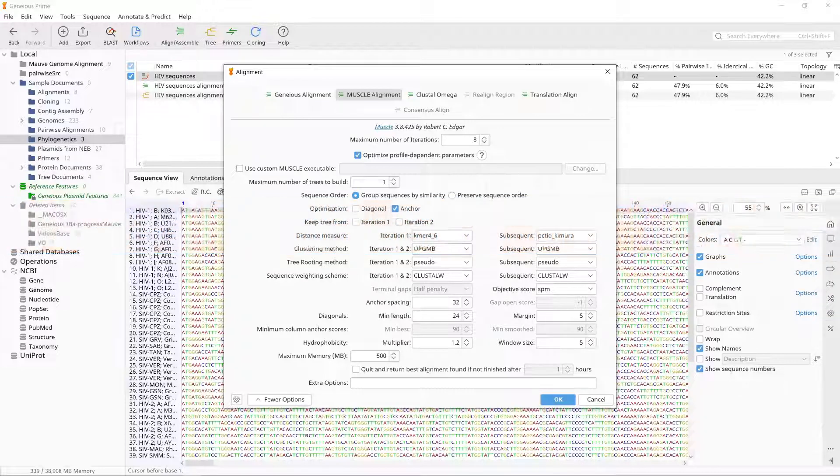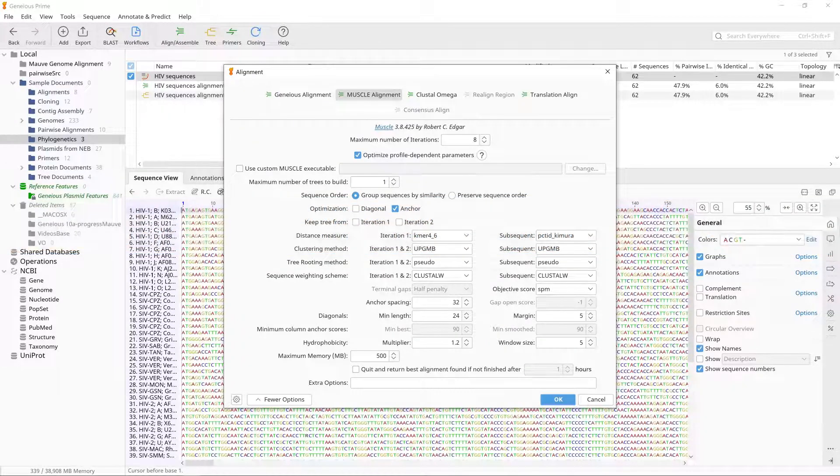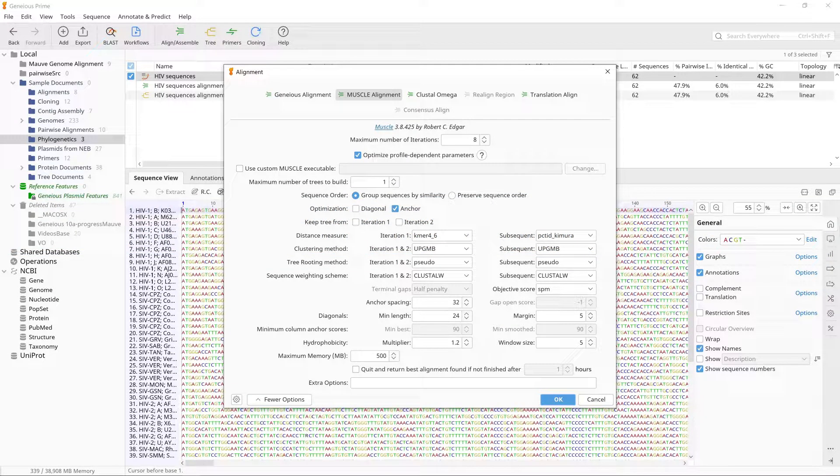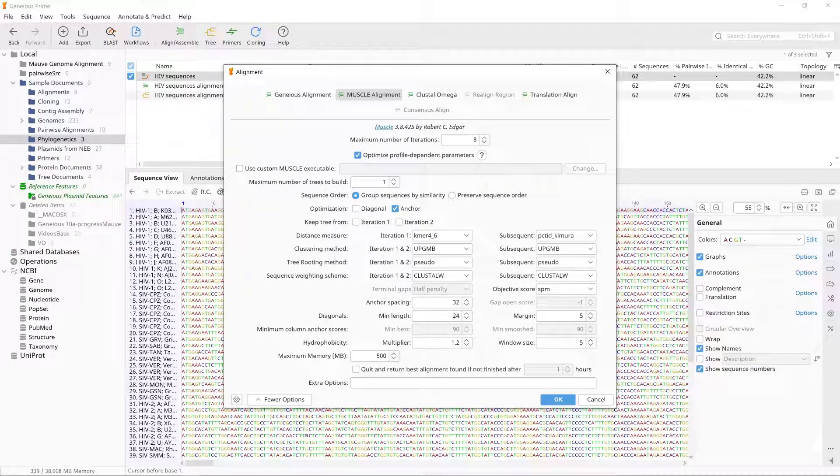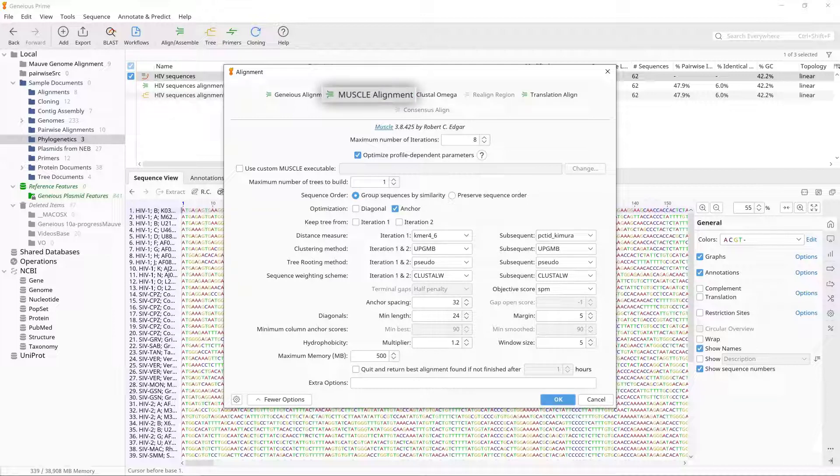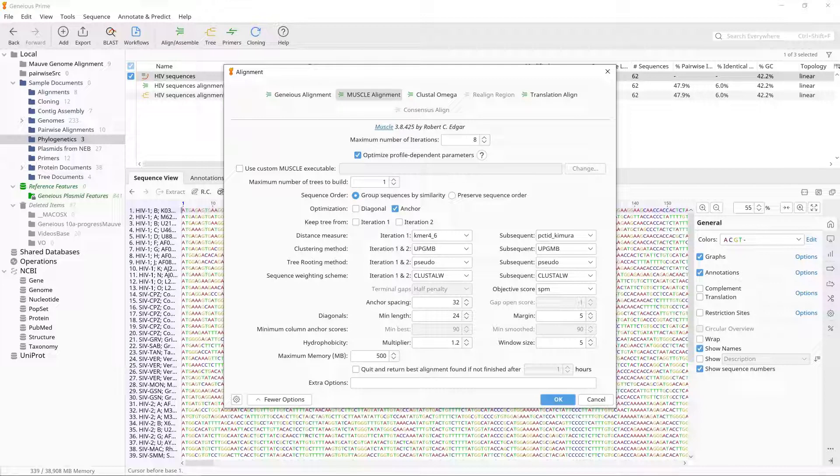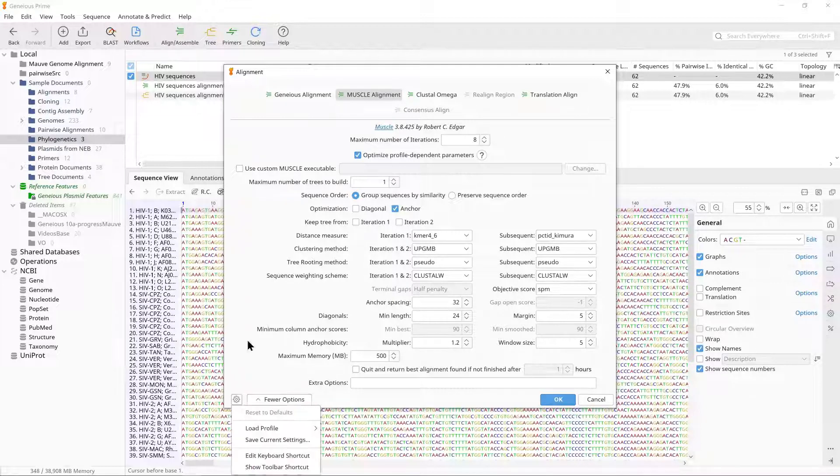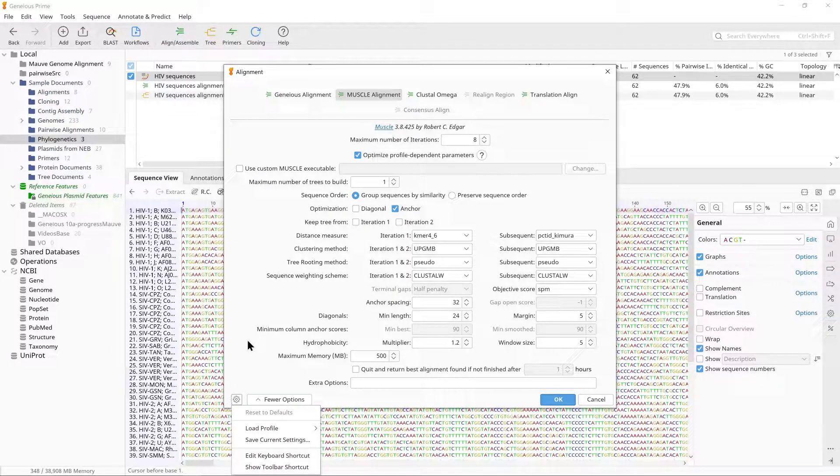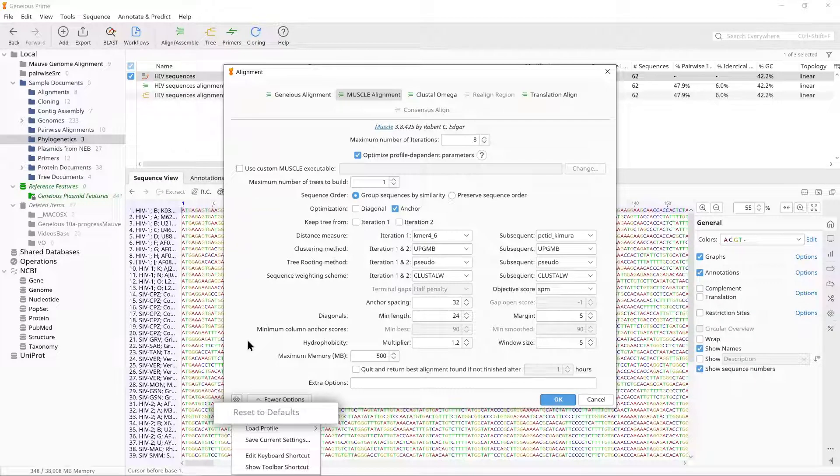We will use the Muscle Aligner for this example, as it is suitable for a medium-sized dataset. Select Muscle Alignment from the alignment options. We will use the default parameters, so click on the settings cog in the bottom left of the window and choose Reset to Defaults.